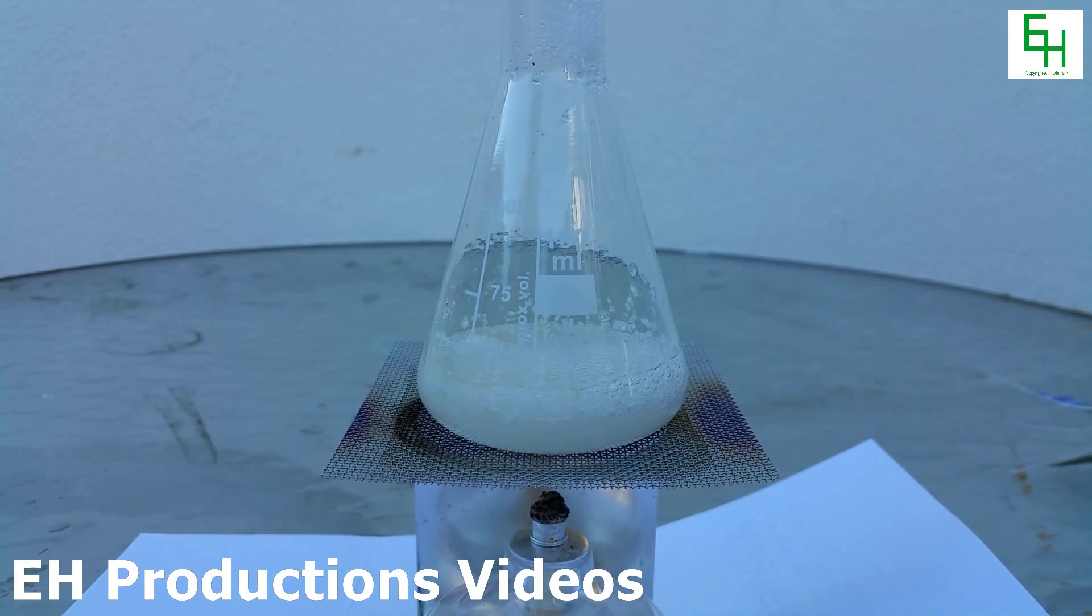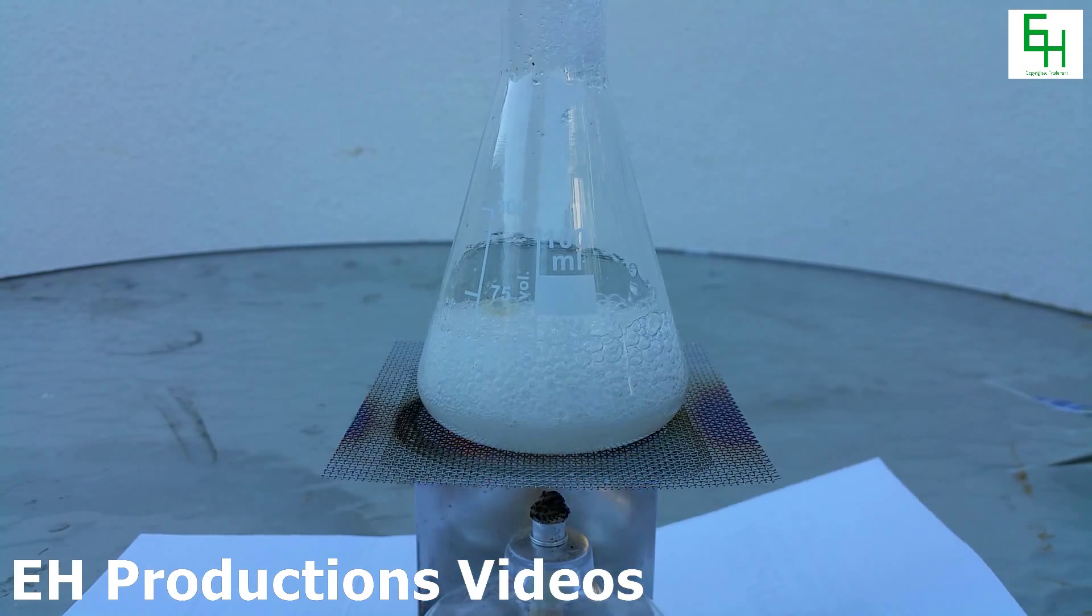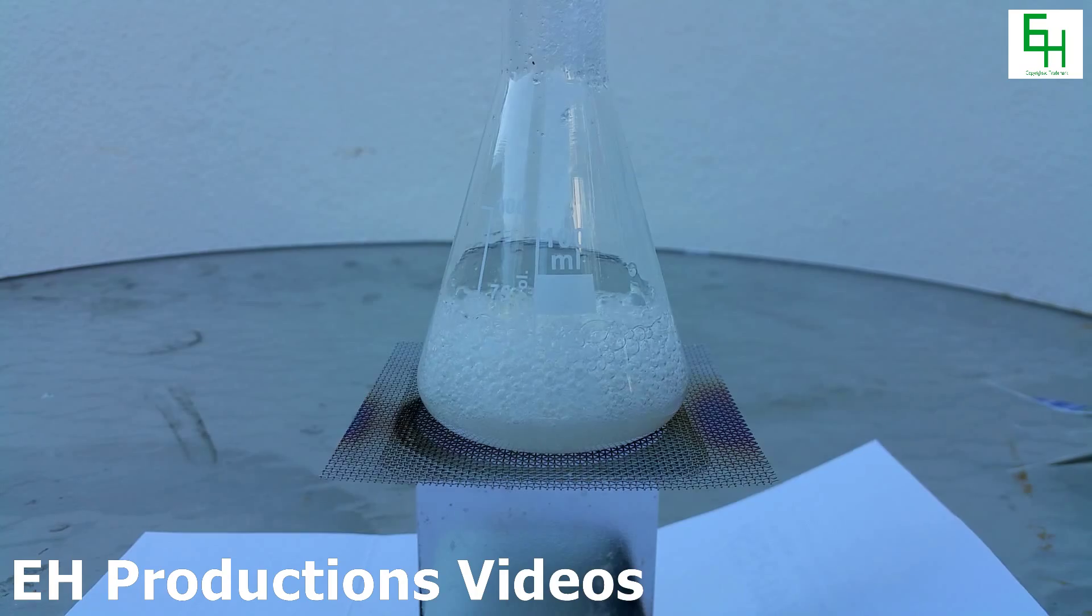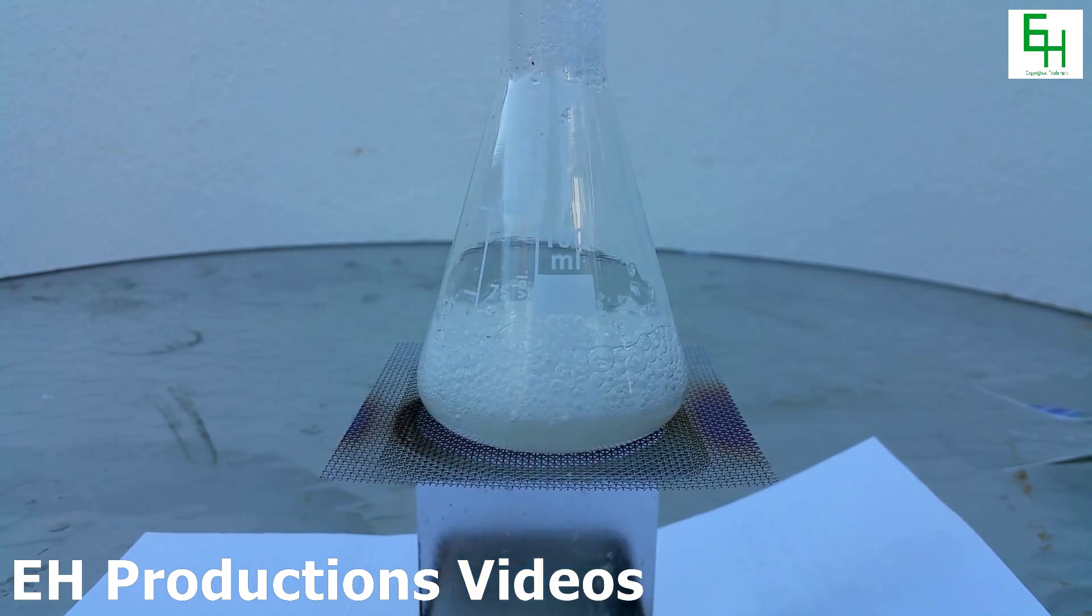The mixture is starting to boil again. And we're going to let it boil a little bit. The mixture is starting to rise up. And that's when we're going to take away the heat. Because we do not want any of the mixture to spill out.